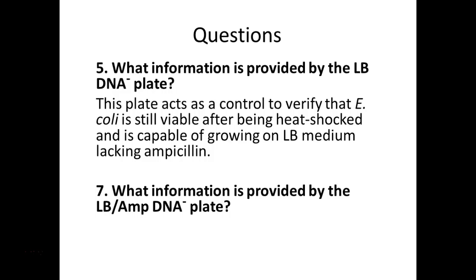Does E. coli naturally have resistance to ampicillin? No, we did this, right? In our Kirby-Bauer experiment, you saw ampicillin kills E. coli, right? It's a penicillin derivative that actually works against E. coli. So in this case, again, it's a negative control such that it should show that ampicillin kills E. coli. So this plate should have what? No growth on it.